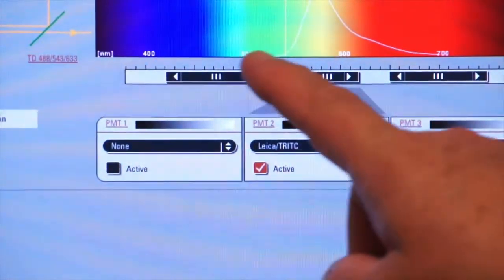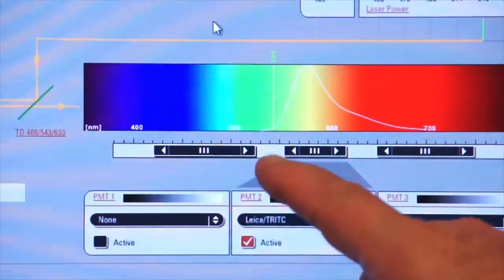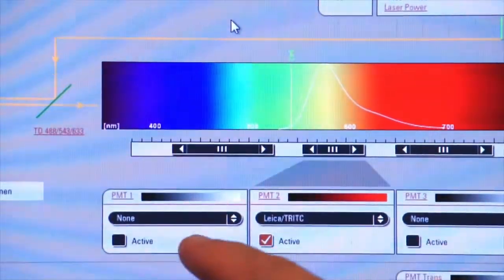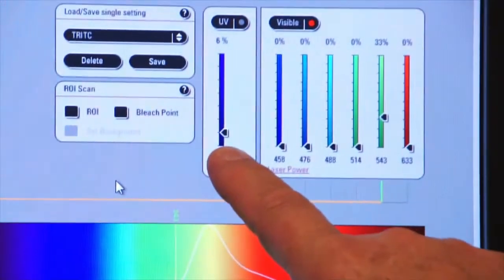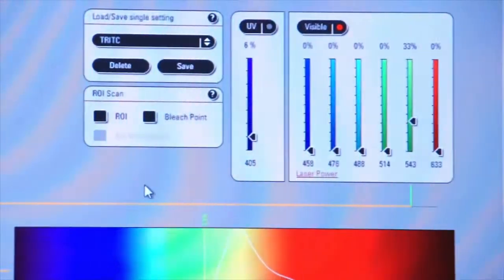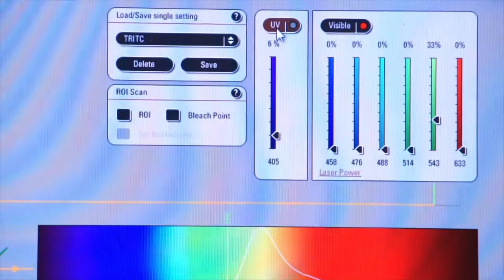I've turned off the FITC laser and the PMT, and now I'm going to turn on the UV laser. You'll see a line generated down here around 405, so I'll turn that on.